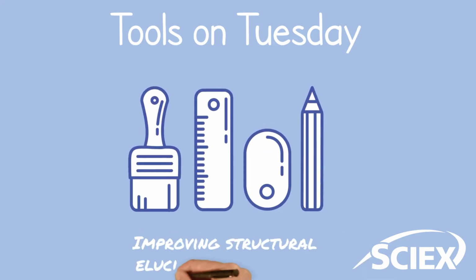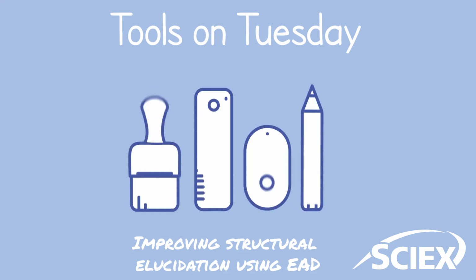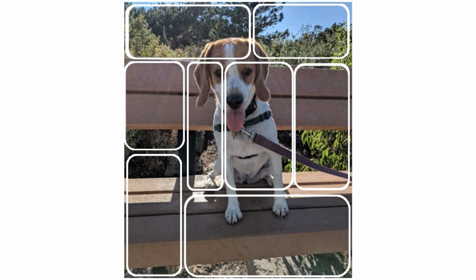Today we're going to be talking about structural elucidation using electron-activated dissociation, or EAD. So when we think about traditional CID, we might find ourselves in a scenario where we only have a few fragments, and this can make structural elucidation really difficult. And that's where EAD comes into play. EAD gives us the possibility of collecting new fragments, which allow us to see what we're looking at much easier.